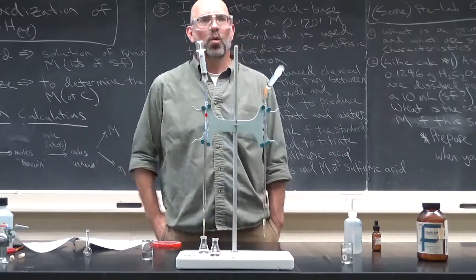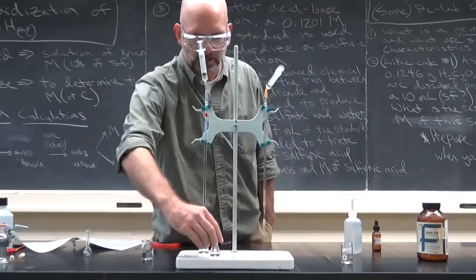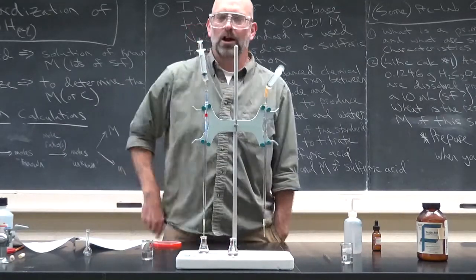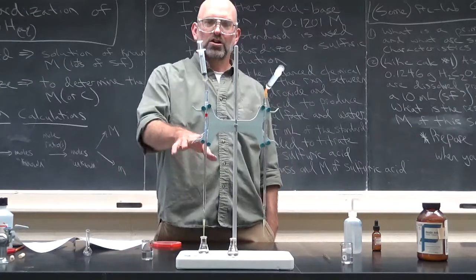Because the color change is going to go from clear and colorless to clear and a slight tinge of pink. So I have one I did before. That is probably too much pink because I over-titrated. I pushed the liquid in way too fast. So I'm going to try to show you what a good titration might look like. All right. Well, first off, what is it?